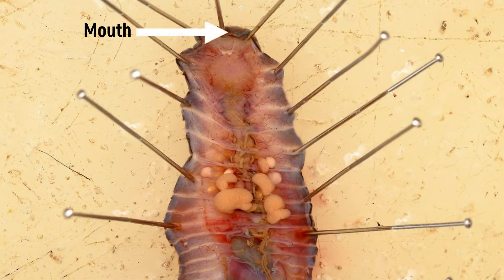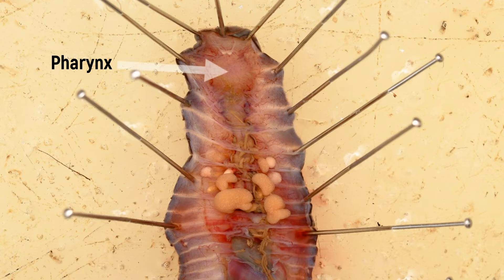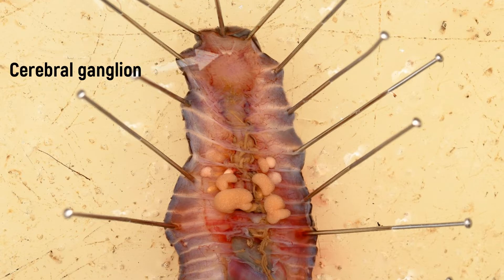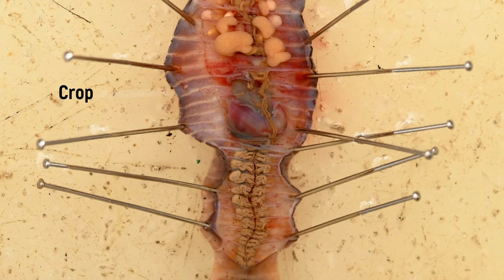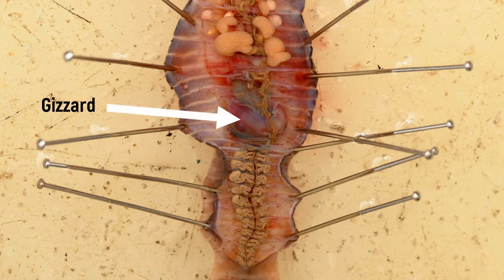The mouth opening is directed downwards and leads into the oral cavity, which merges in the end into the muscular pharynx. The suprapharyngeal ganglion, which is striking because of its white colour, lies dorsally on the front of the pharynx. The pharynx is joined by the slimmer esophagus, which extends approximately from the seventh to the thirteenth segment. The esophagus is followed by the rounded crop, and immediately after that by the gizzard, which is equipped with very strong muscles and a strong cuticle, in which the food consisting of old leaves and other plant parts is ground up with the help of grains of sand taken up together with the food.